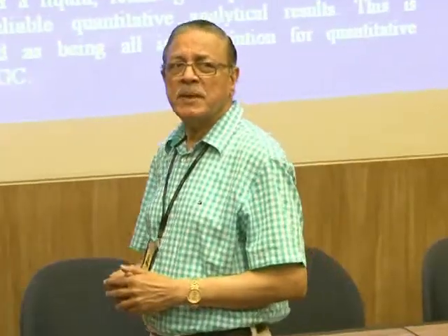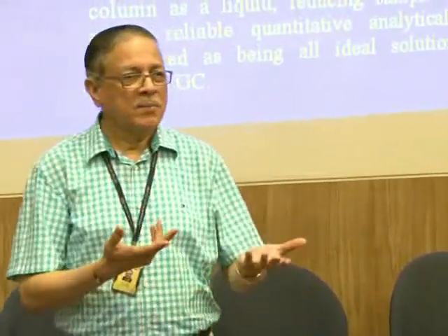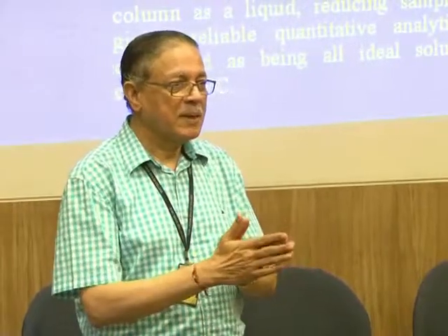Injection syringe, you have all seen it, but this is in microliter. Normally our injection syringe is in milliliters. You are scared of having injectables, na? You have seen that advertisement, 1 minute, 1 minute. Right? Have you seen that? Sardarji is refusing to have injection.